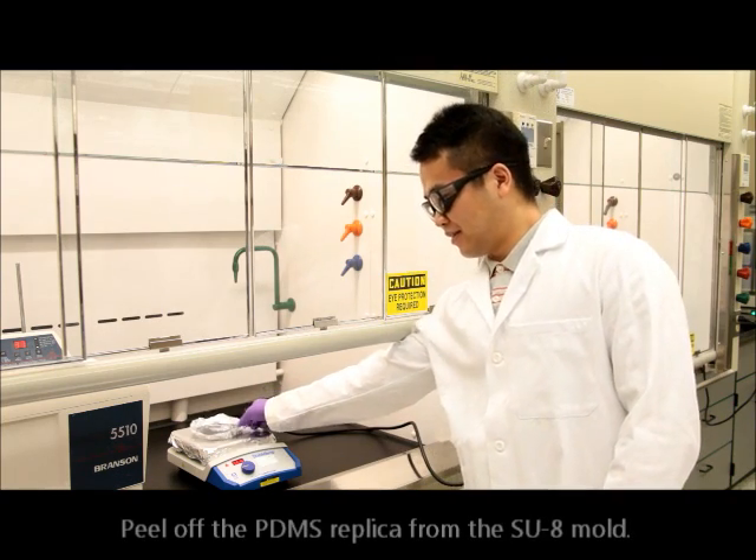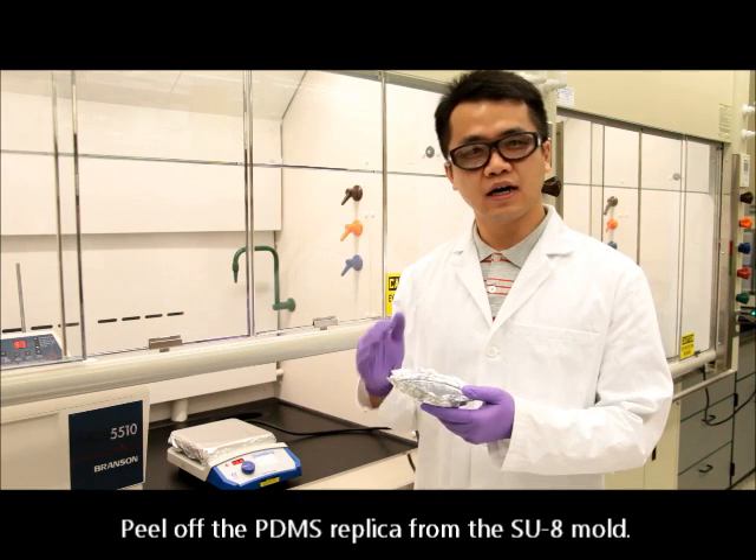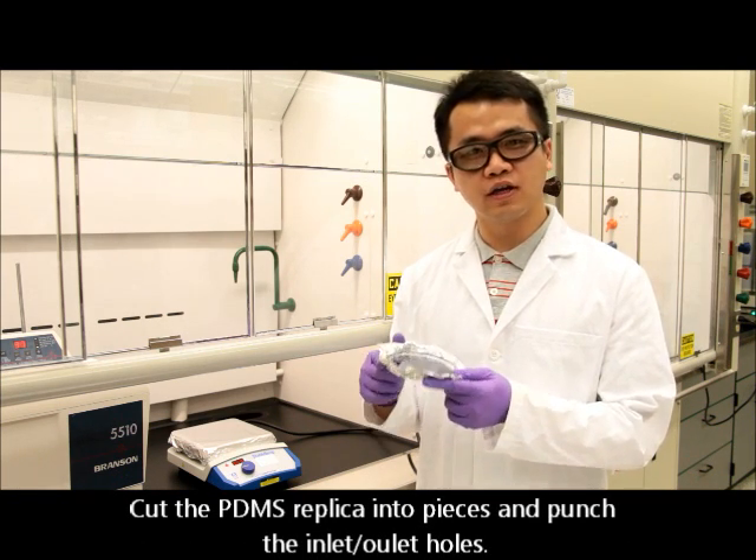Now the PDMS is fully cured. We can peel it off from the mold, cut it into pieces, and punch the holes for channel inlets and outlets.